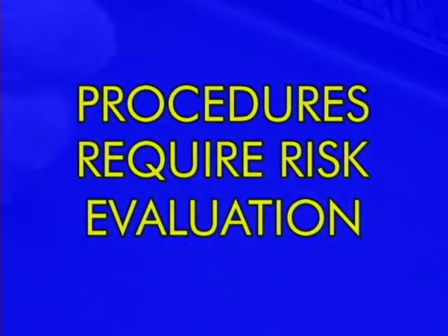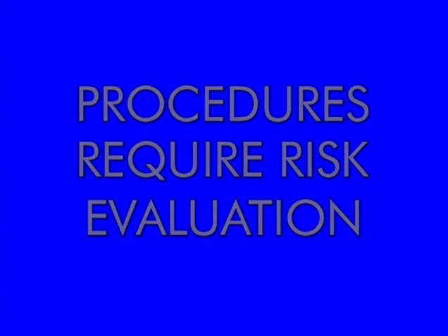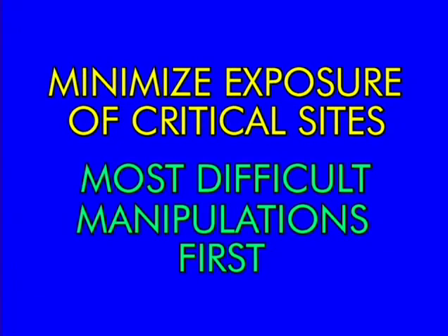When developing and practicing procedures, an evaluation of risk factors should be made. To the extent possible, minimize the time that any critical site or pathway is exposed. Perform the most difficult manipulations in the process first, if possible, with the least exposure of critical sites and pathways.